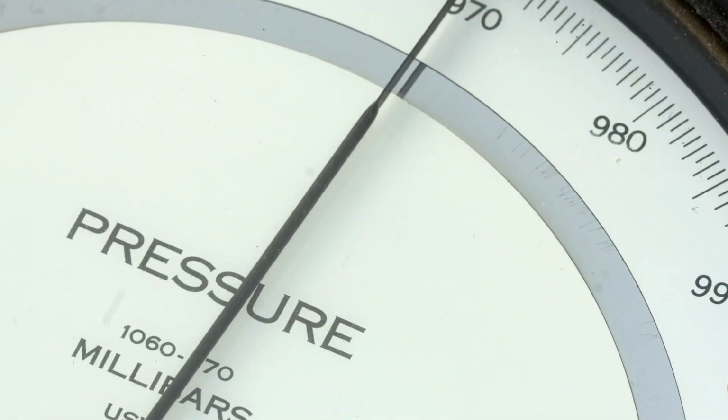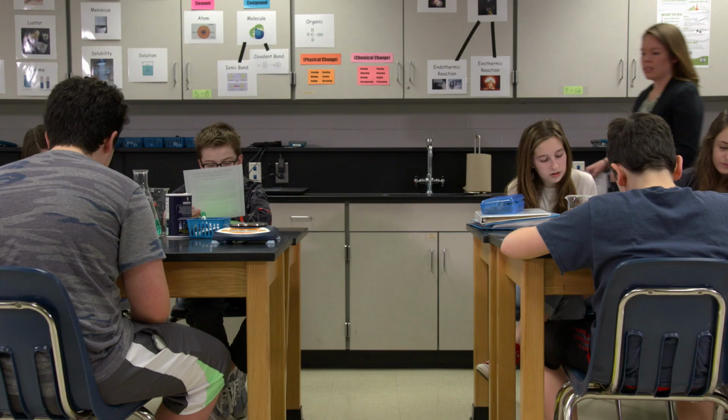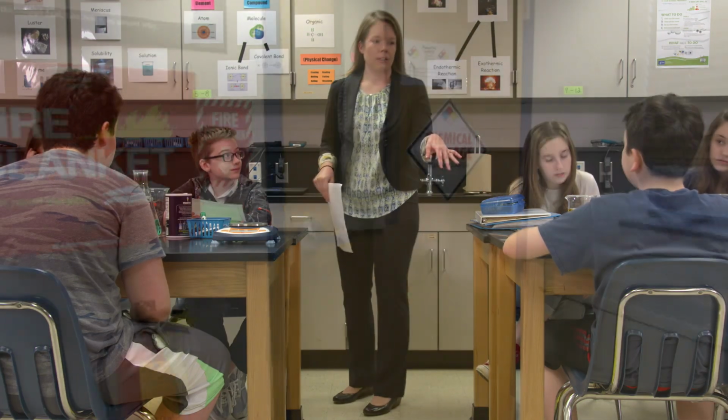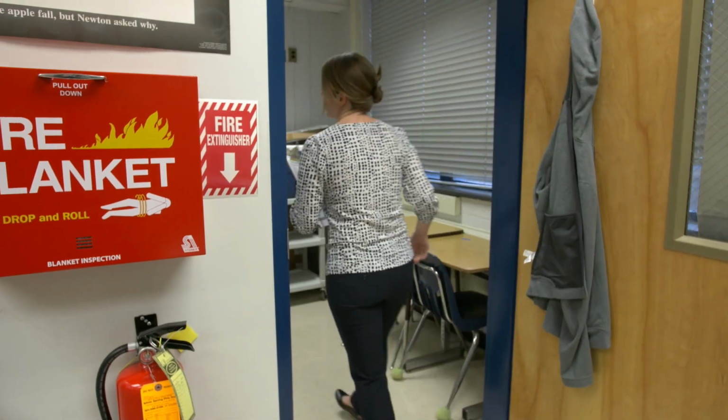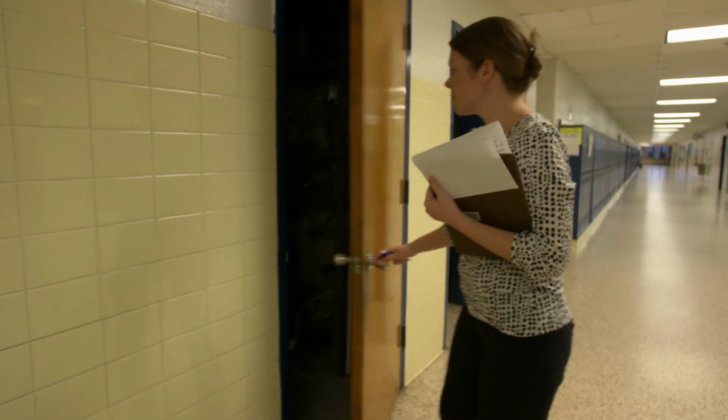Elemental mercury, often abbreviated by its chemical symbol, Hg, is present in many common items found at schools and homes. Your school might even have containers of mercury in science classrooms. It is a good idea to take an inventory of mercury and mercury-containing items so you would know where mercury is located at your school. Many mercury spills at schools also happen when students bring mercury from home to show friends. Because there may be mercury in your school, it's important that you know its characteristics.